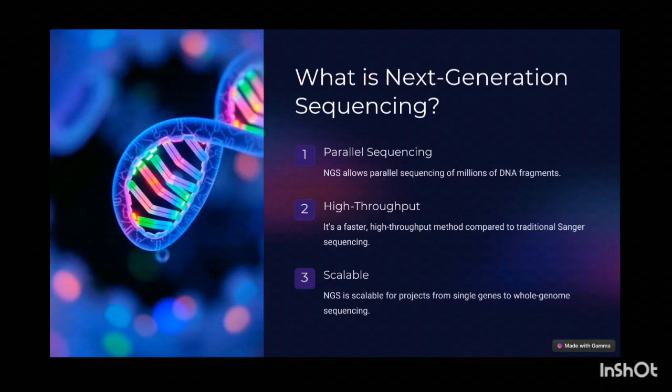What she will do is extract blood or saliva from the patient and isolate the DNA. She purifies the DNA, then does fragmentation, cutting it into smaller pieces of nucleotides, and goes for PCR. While doing the PCR, she'll add some adapters. We will be learning about adapters and everything in the upcoming class.